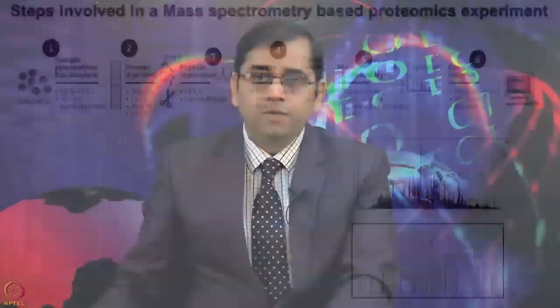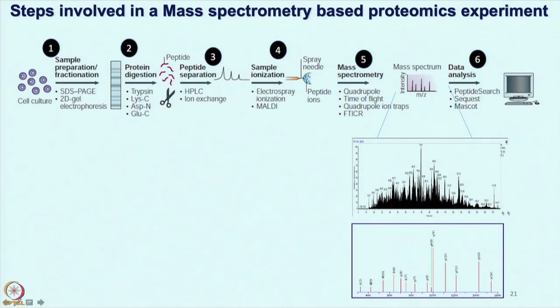Okay, so now you are familiar with how you can use different parameters and settings for the MS and MSMS analysis. After doing a good run of these experiments from the same sample, you will see these chromatograms shown here on the screen, which show the time versus the intensity of these peptides. As I mentioned, you would like to see a good Gaussian distribution of the peptides coming out of your sample. Now, how do we make sense of this information, that is, what these proteins are?